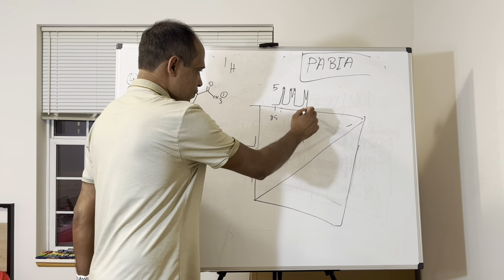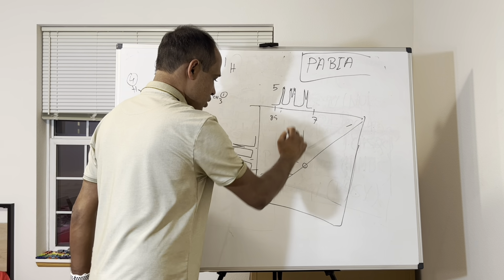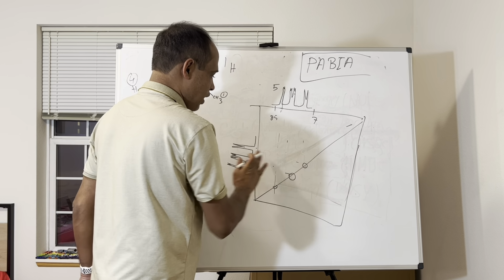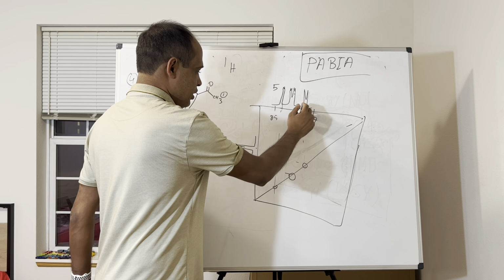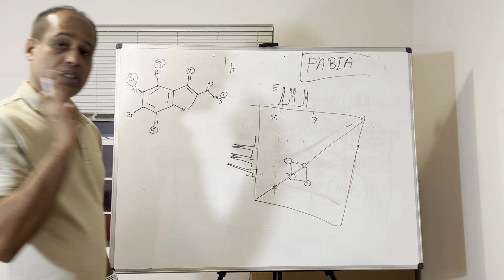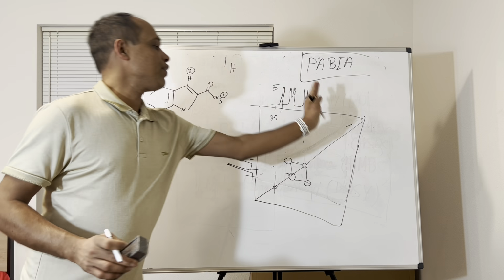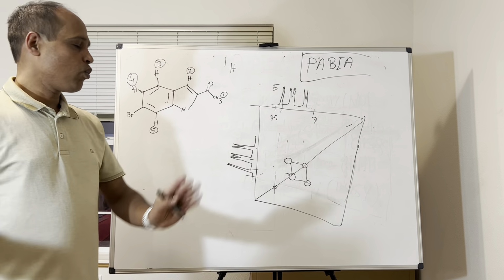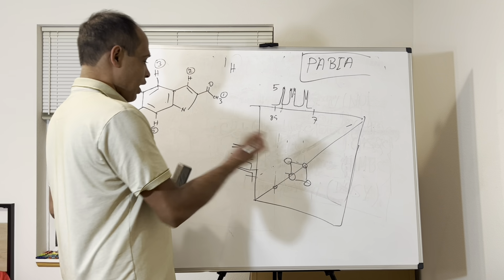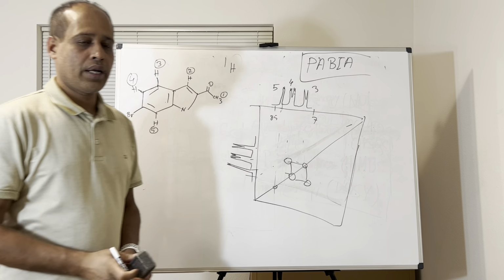Now, definitely, if you draw this, okay, definitely you will see these two a cross peak here. That means just COSY, take the COSY for this, targeting this proton NMR. Whatever it is showing in the other part, it doesn't matter, we'll come back. So COSY will determine the 3 and 4 positions. So definitely you will get this is 3 and this is 4 with the relation, okay?